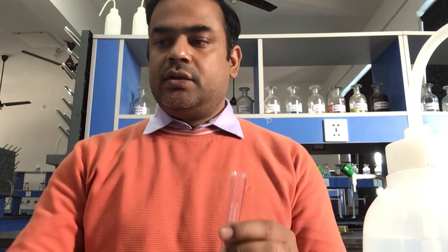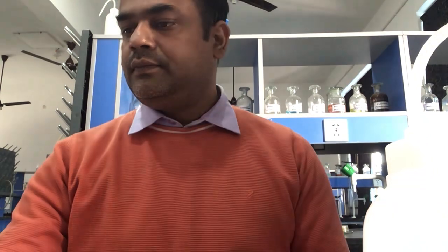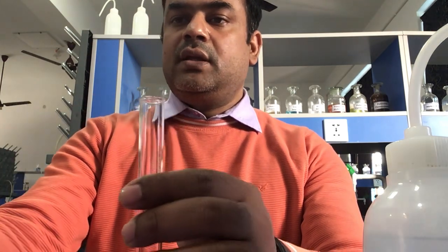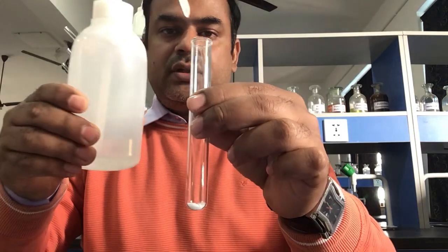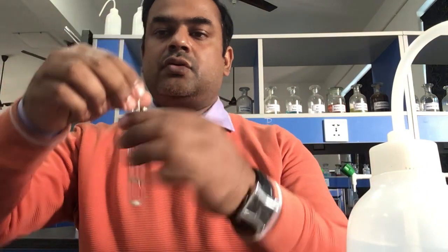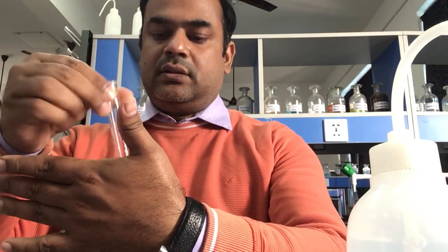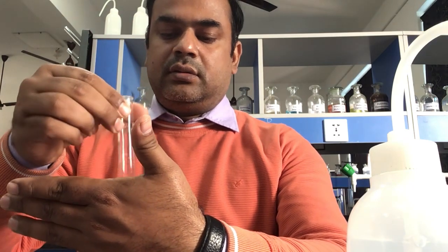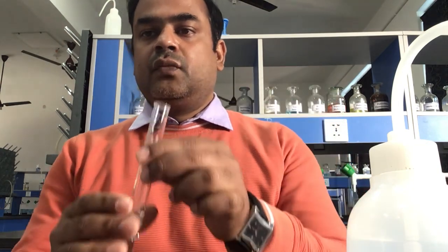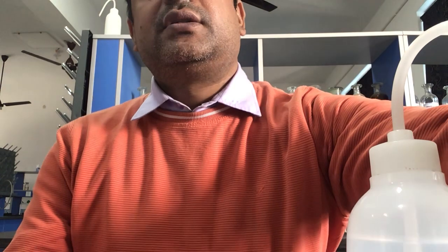Now another test tube is taken. In this test tube, a pinch of salt is taken and distilled water is added into it. The salt is dissolved by swirling. You can see the salt is completely soluble in water.